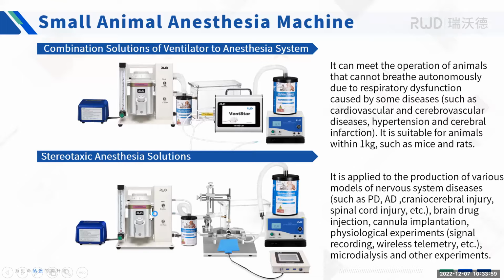And we can also use the anesthesia machine with our stereotaxic. We only need to replace the anesthesia mask with this stereotaxic mask. The mask connects to this end, and the gas will flow through this tube to this mask. So we only need to change the mask. This one changes the mask to the ventilator. This one changes the mask to the stereotaxic mask. We only need to replace this part. The gas source, the machine, and the recovery system, we don't need to change.